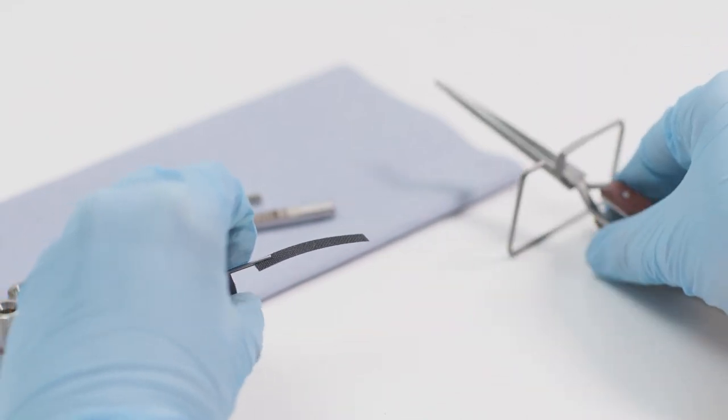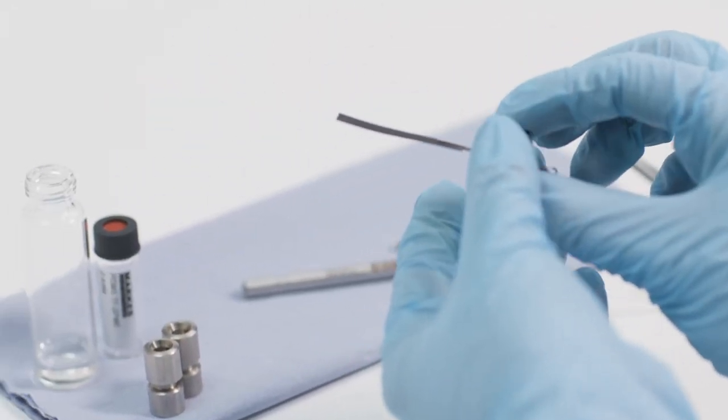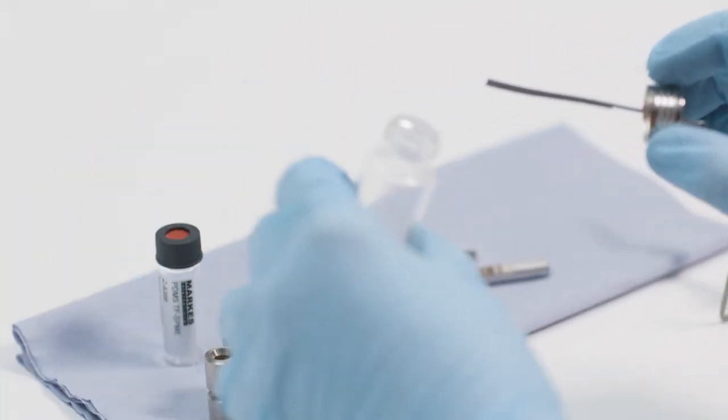Seal the membrane in the vial and adjust the membrane insertion depth by moving the cotter pin accordingly.